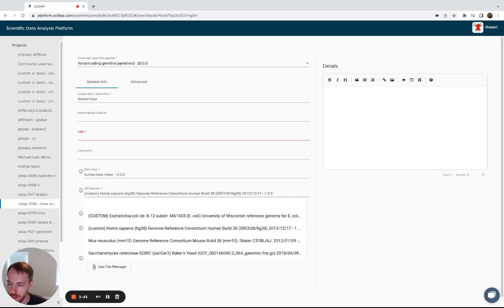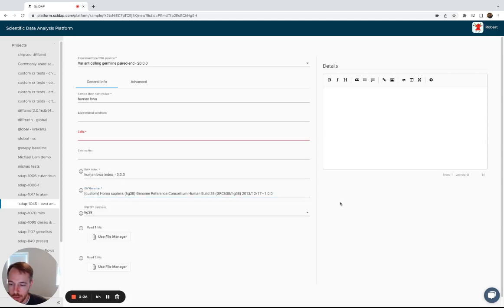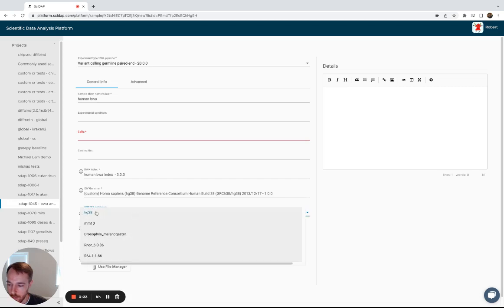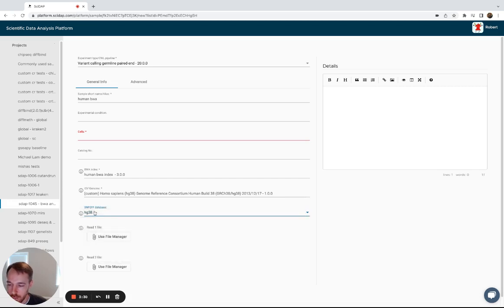And then select the base reference genome that that BWA index was built from for IGV genome browsing, and then the last drop-down is for again for the genome, but in this case it's for predicting the SNP effects with SNPF.